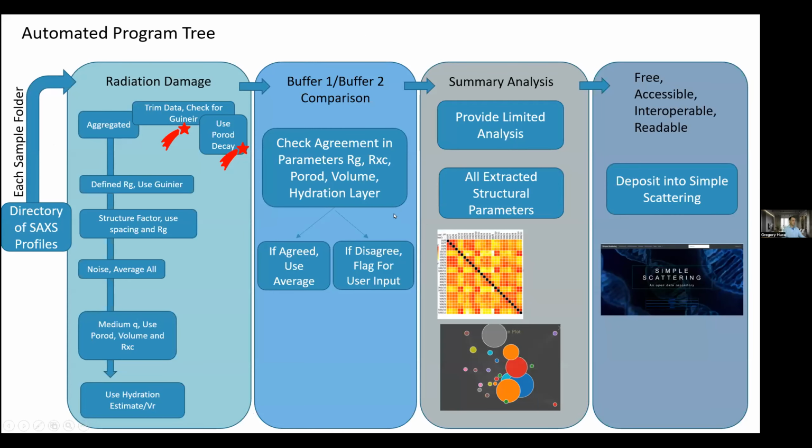And I won't go through the details. One of the things that many of you struggle with, we do too, is that processing is slow. And so we are working on a library to increase the speed at which we can process data. We've created some of these things which you'll hear about today, ways of analyzing the data sets, depositing the data sets, etc. We're working through this, and hopefully we'll finish that up this year.